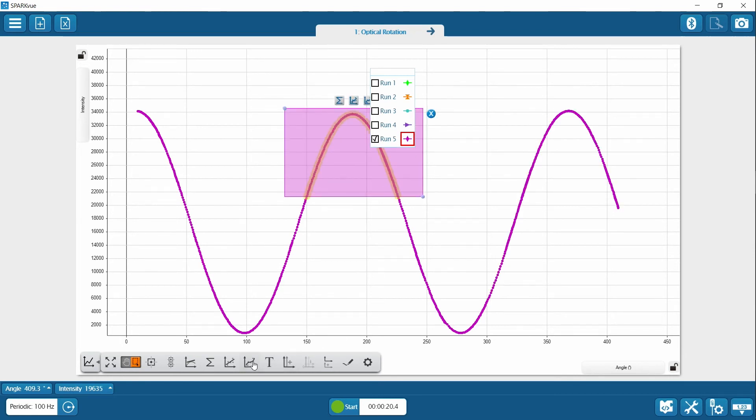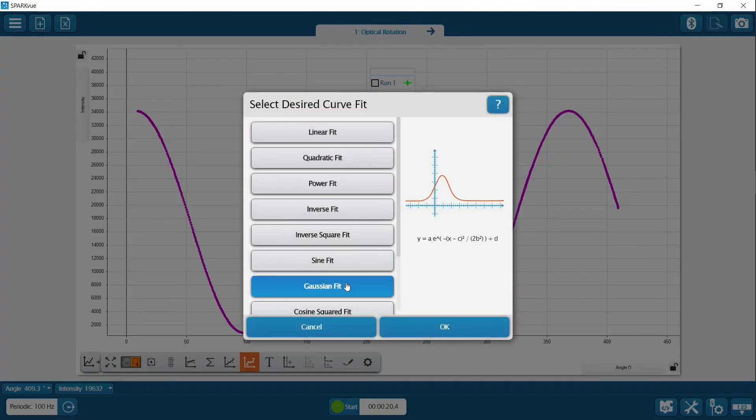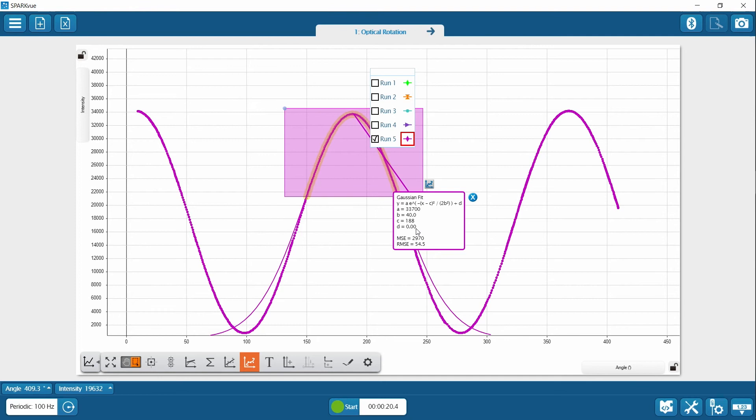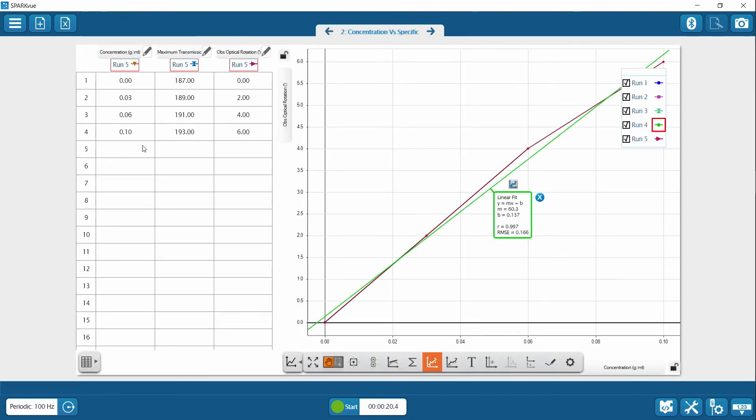We use the key down here, or you can use the one up top. We'll use the Gaussian fit, and this is at 188. So when light turns to 188 peak, that's right in here, 188. We want to know what the concentration is. So what's the shift from normal, from water? It is a one degree shift. So let's put that in, 1.0.